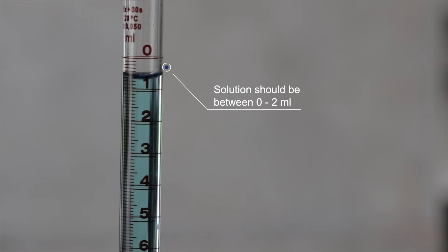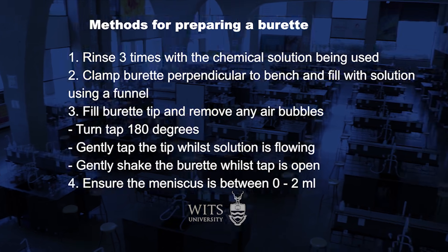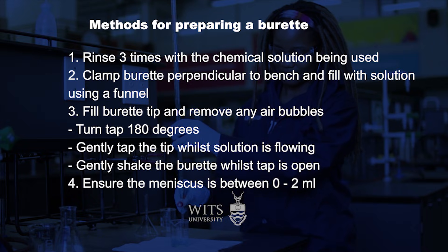At this point the burette is ready for titration. If you follow the methods and tips described in this video you should be able to prepare your burette for titration experiments with ease and efficiency.